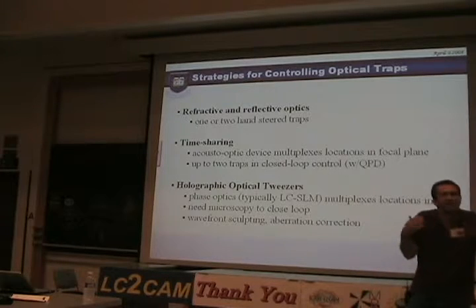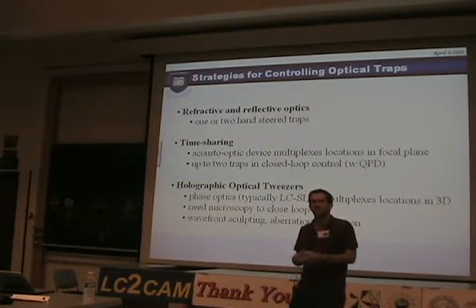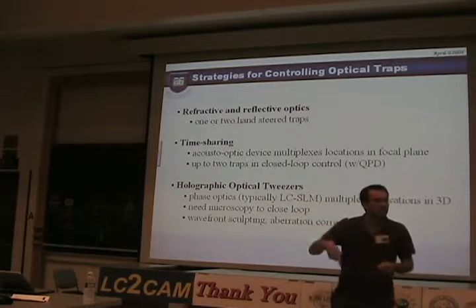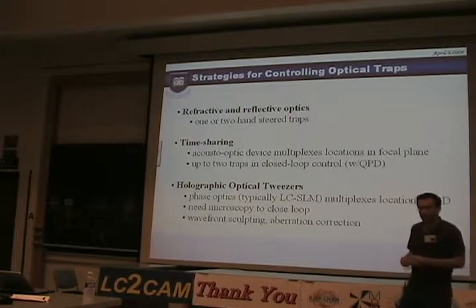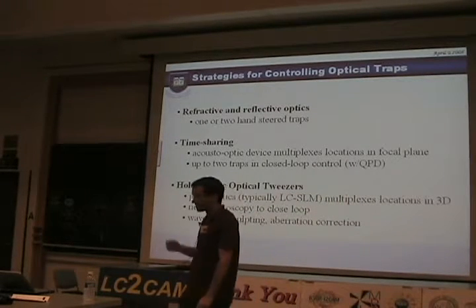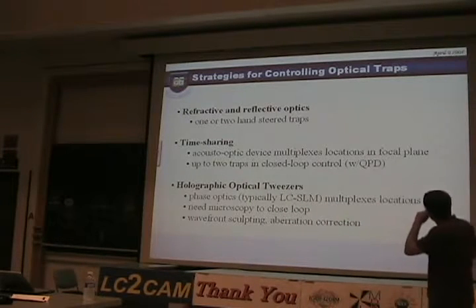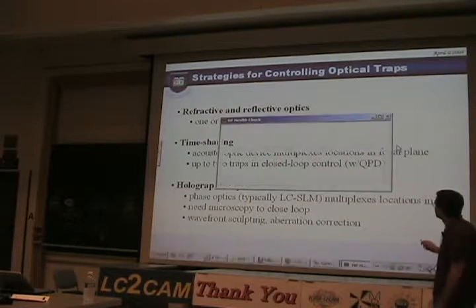Those of you that went to the laser show today saw exactly how this works, right? They basically had an optical trapping setup, and they had some sort of acousto-optic device that was very rapidly moving the beam of light around, faster than your eye could resolve, and so it would make all these patterns. You can do the same thing.